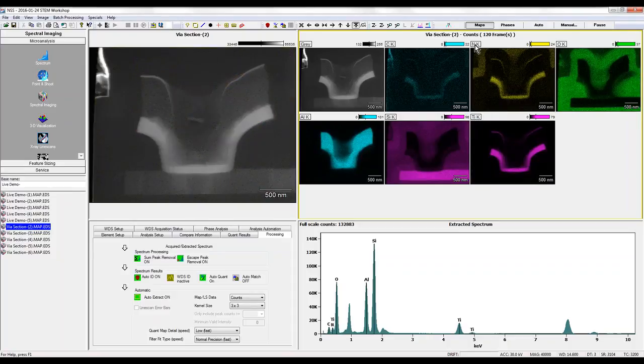But again, what we're trying to talk about here is mapping the nano. So if we put a ruler on these layers that we're looking at here, we can see that this layer here that we've resolved with quite good detail is only 170 nanometers thick at the bottom. And if we look at the one on the top, we can see that the layer is only about 20 to 30 nanometers thick. So as I mentioned, we could improve on the spatial resolution of mapping by a factor of almost 100 by making these thin samples and doing the analysis in transmitted mode.